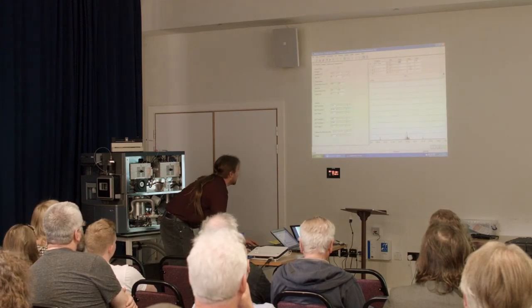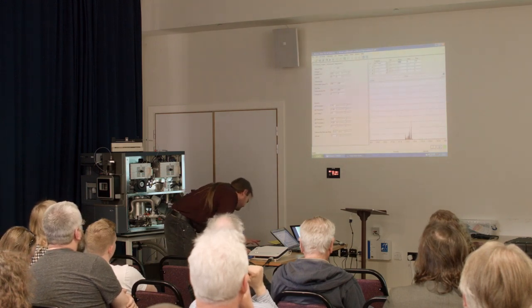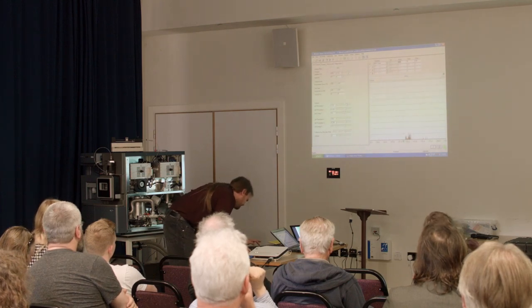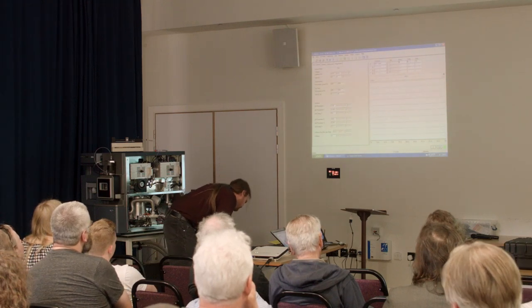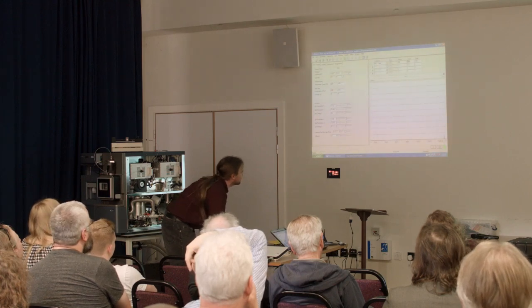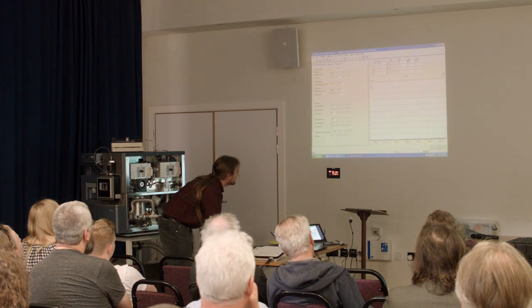Right, let's just have a look on this. So if I set this mass here, this is the mass in the middle of the screen. If I set it to about mass 80, so 80 is going to go in the middle, and I increase the span to 140, we should be able to see. Oh, there is our paracetamol at the end there.